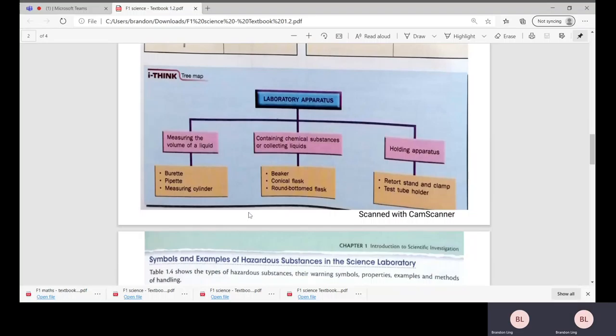All the lab apparatus in our science lab can be used for measuring volume, containing chemical substances, and holding apparatus, depending on what we want and our objectives of the experiment. These are the examples on the orange boxes: burettes, pipettes, measuring cylinder.